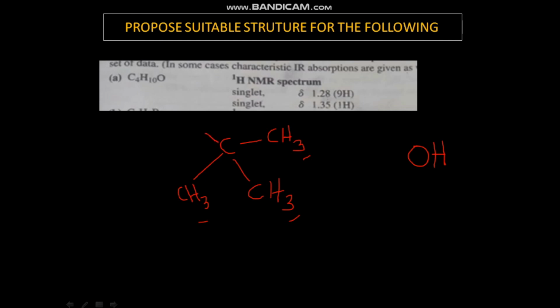So when it is a hydroxyl proton, now this structure is very much consistent with the data that are being given. Therefore the name of the molecule for this structure is 2-methyl-2-propanol. Thank you very much.